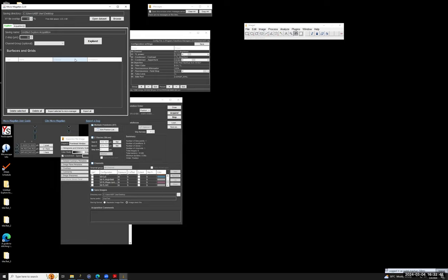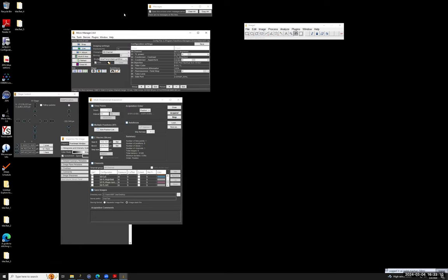it somehow doesn't work with any of our Zeiss microscopes because it doesn't open the shutter for illumination. I tested it on another brand of microscope, and it worked okay. So there is something not entirely clear here. So those are examples of the plugins.